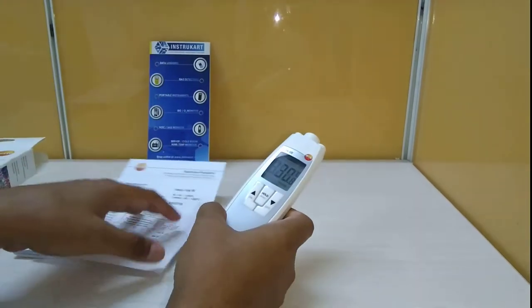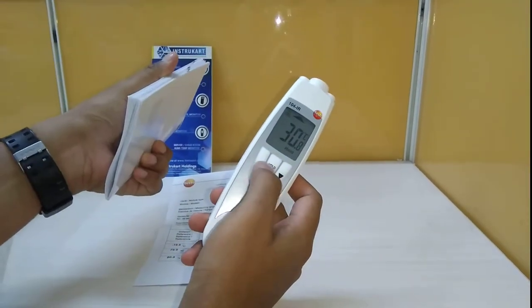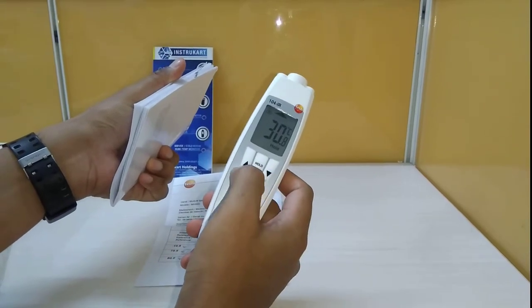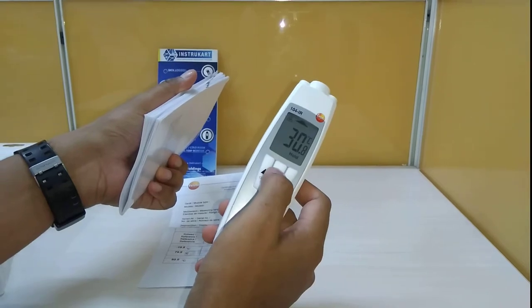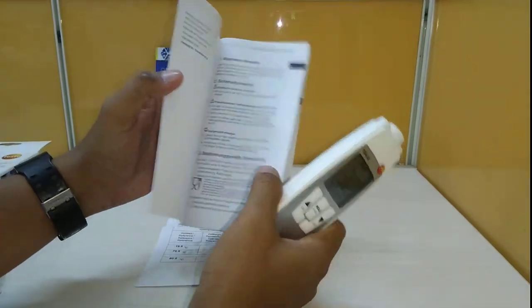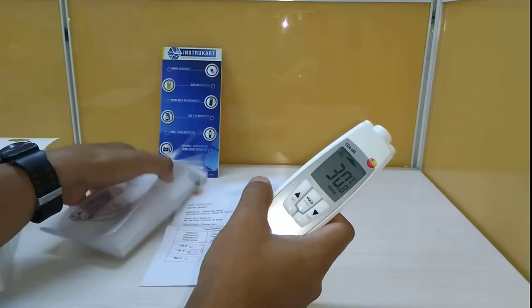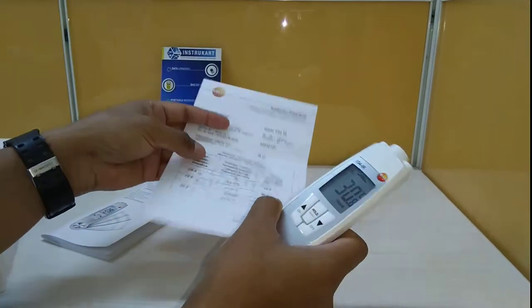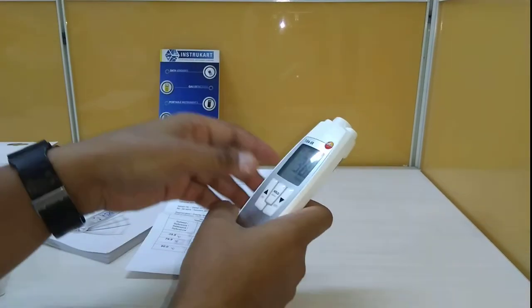With this instrument you will get an instruction manual on how to use it. There are three buttons on top: on/off and hold, which will show the minimum and maximum temperature recorded. You can browse the instruction manual to see how to use this device, and you will also receive a calibration certificate valid for one year.